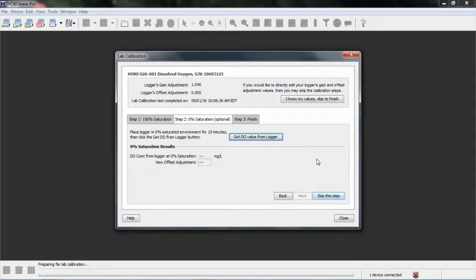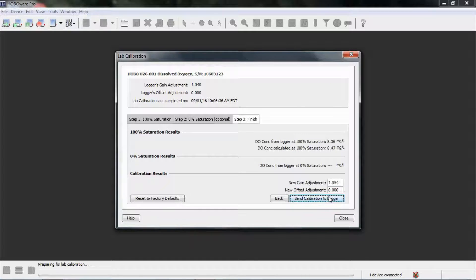There's our new gain adjustment. We'll click next. We're going to skip the zero percent saturation step — we're not going to use the sodium sulfite solution because it's a new logger. If you are recalibrating a logger that's been in the field, it's a good idea to follow that step. However, be very careful to clean the sensor with deionized water thoroughly after exposing it to sodium sulfite before deploying. So I'm going to skip this step and leave the zero value alone. Here is our final configuration — we send the calibration to the logger by clicking the blue checkbox, and it has been sent.